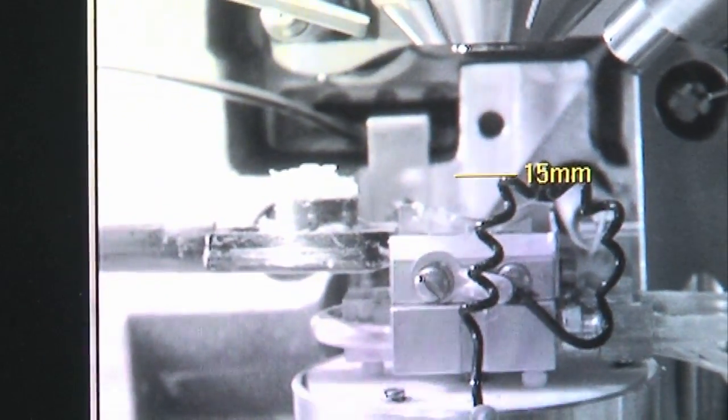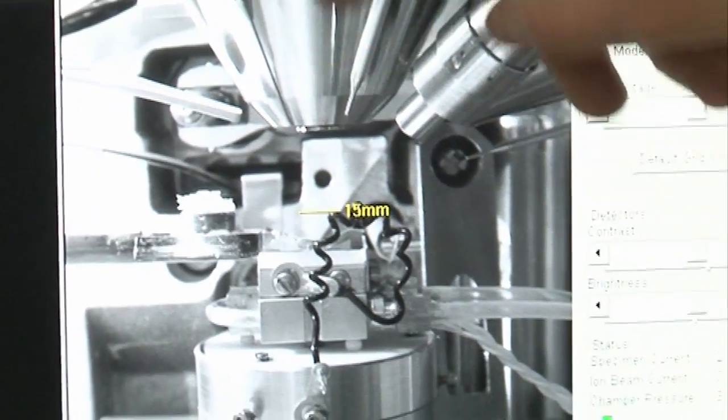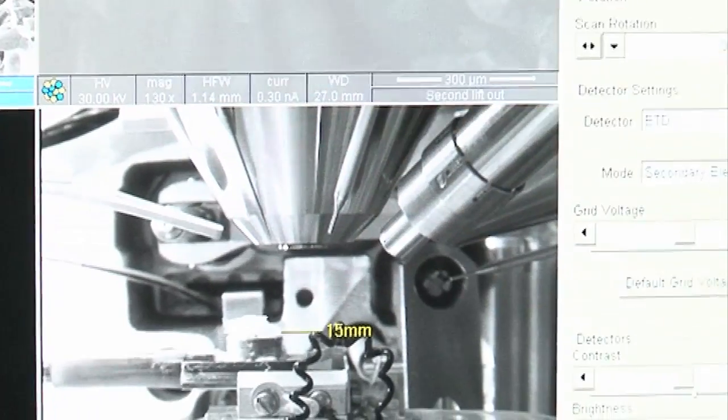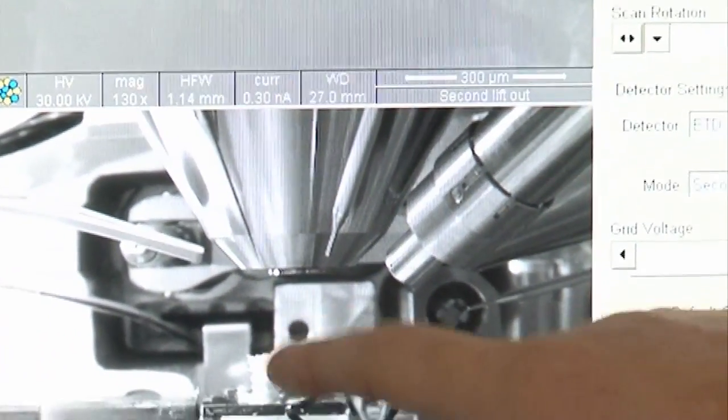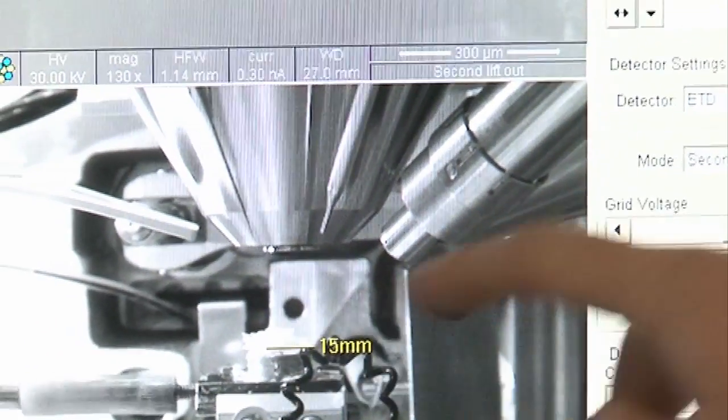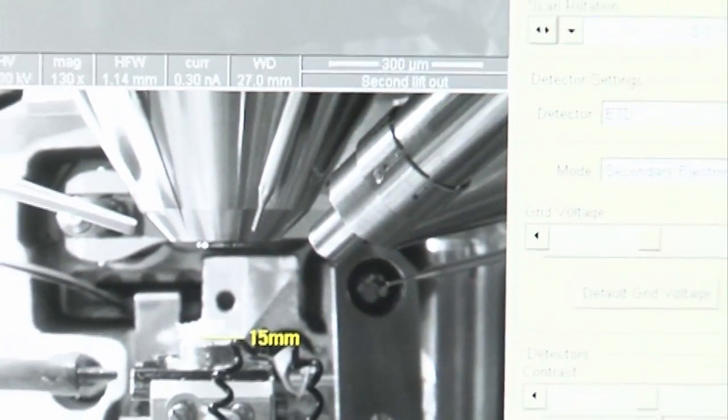It's loading onto the sample stage. As he's loading it in, what we have up here is the column down which the electrons come - the electrons that we use for imaging. We're going to have the sample down here with those electrons striking the sample, and then we get electrons which are back-scattered off. We're measuring those electrons with the detector here and it's with this that we actually build up the image.